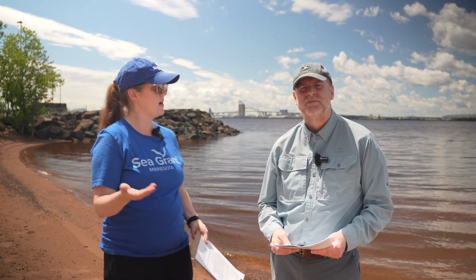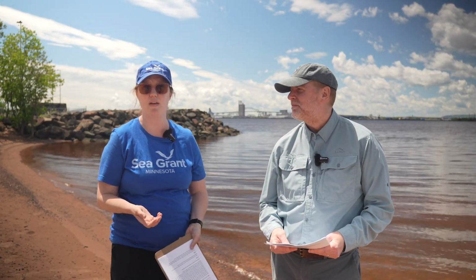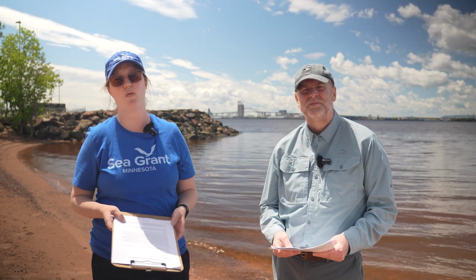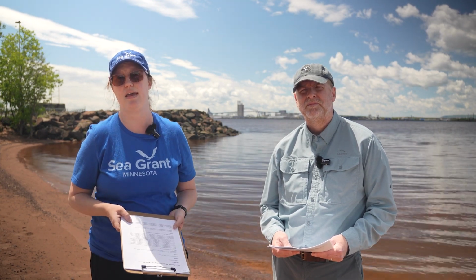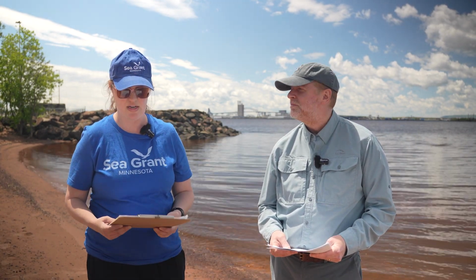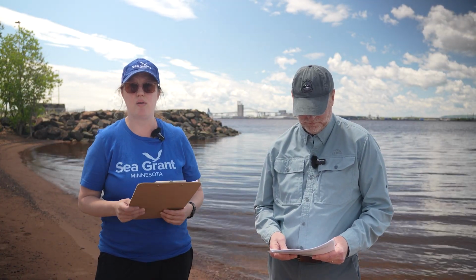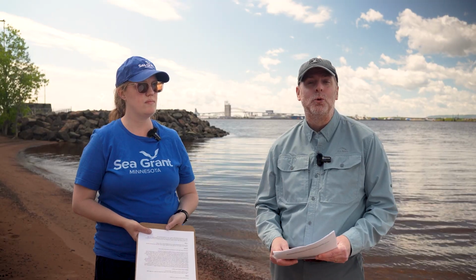Monitoring these two water quality problems is difficult because they are both episodic and unpredictable. We don't know where and when we might have an influx of chloride into a body of water, or where we might see an algal bloom pop up. So today we're going to talk about how to observe these, how to identify them, and how to collect a water sample.